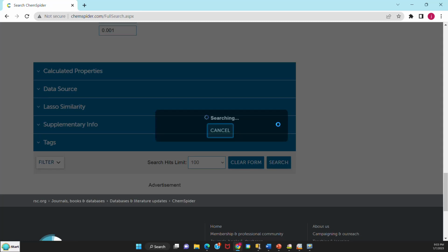Sometimes it might take 45 seconds to a minute to do this, so if it takes too long I might cut it out and come back at a later time, so you don't have to sit here and watch the search occurring. But I'll wait for a few more seconds and see what happens before I stop it, at least so what you see, and then wait till it comes back with the results to jump back in again.